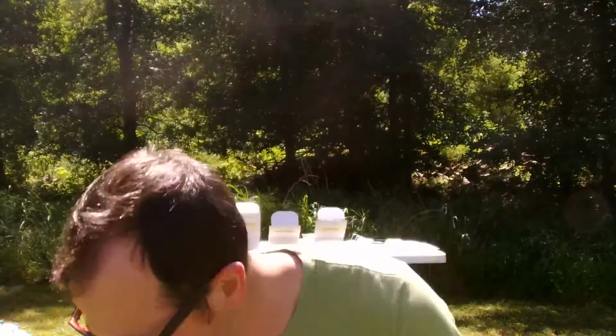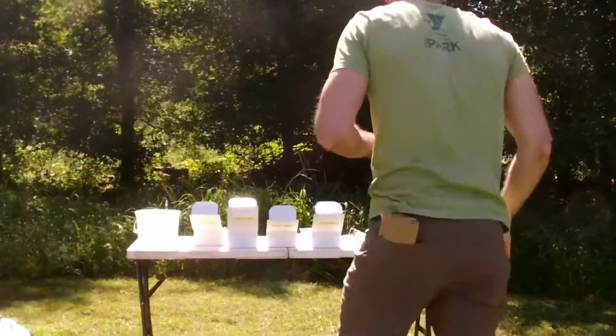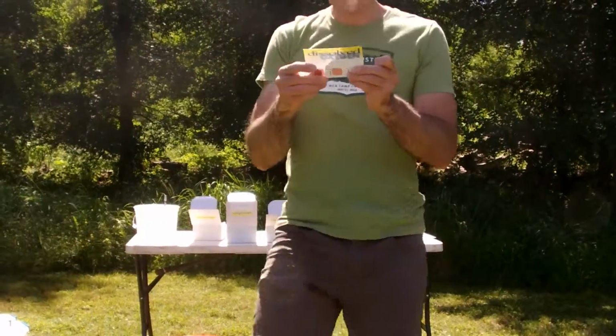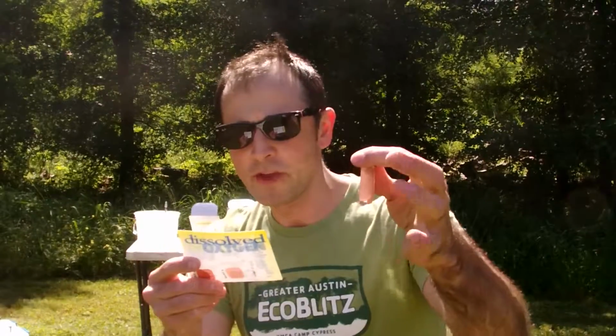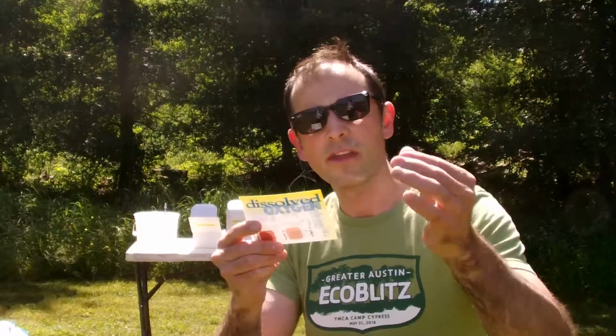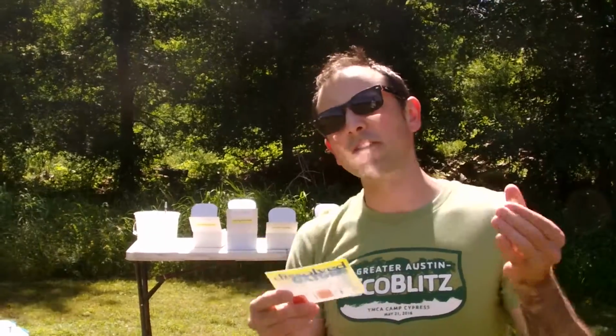I really don't know. But this all is gonna take about 5 minutes. If you look at your chart. So what it's gonna say is after you've capped it, you're going to mix by inverting the tablets for about 4 minutes. And then we're going to wait 5 minutes, okay? So you're going to have a stopwatch with you, all right? And I will grab my phone as my timer.